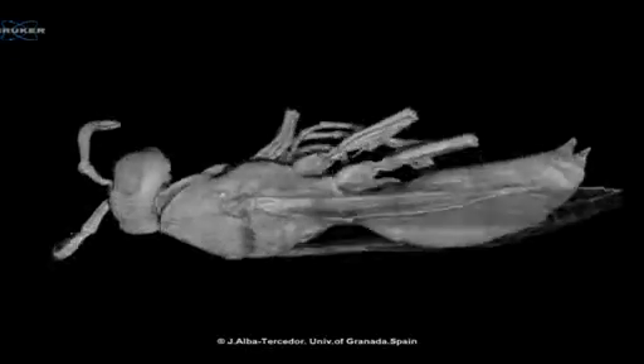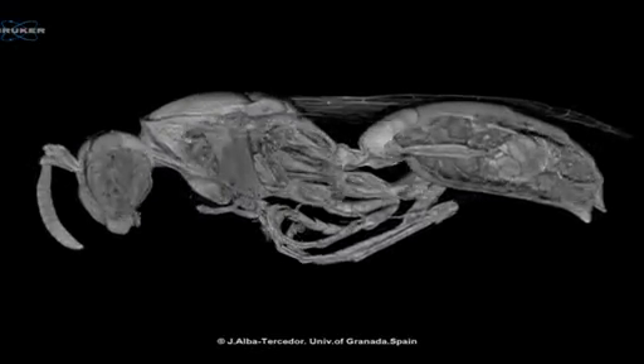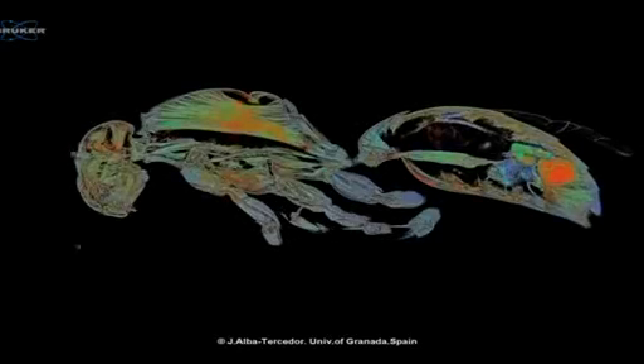This 3D model shows in stunning clarity the internal and external structures of Pulisides gallicus, otherwise known as the common European paper wasp.